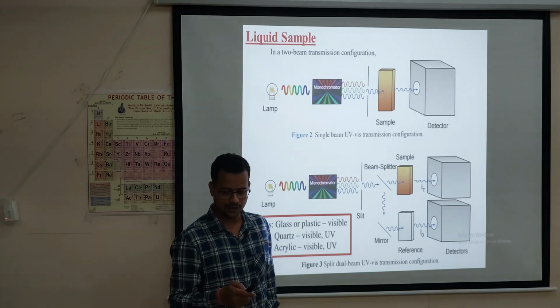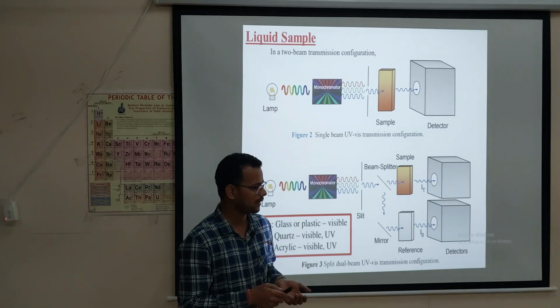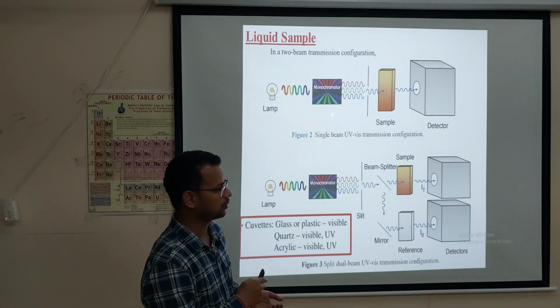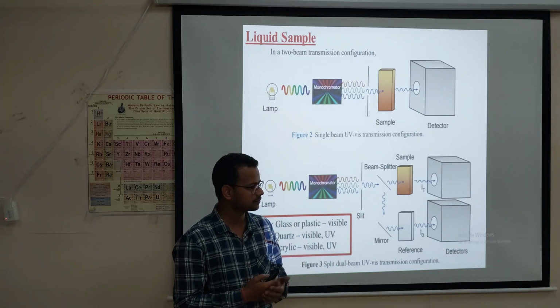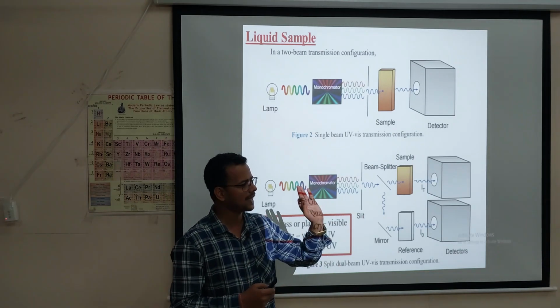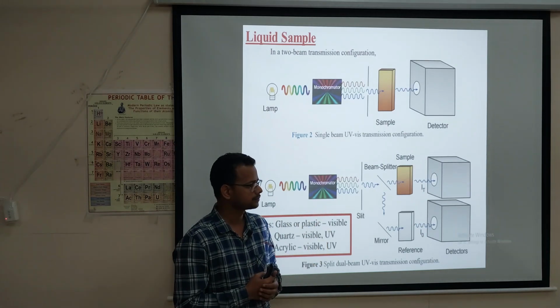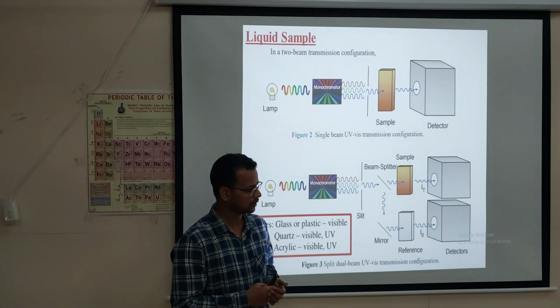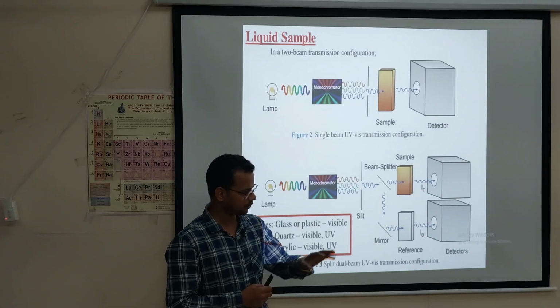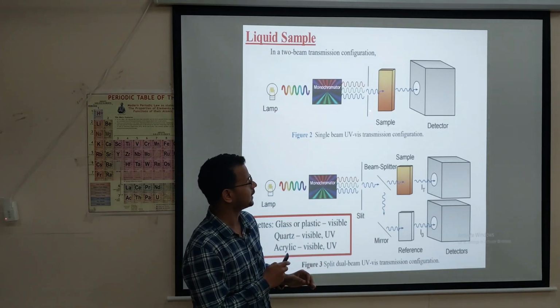If actually the monochromator separates light into various colors and the slit is not able to choose which color will pass, a slit does only one thing: it narrows the beam. Polychromatic, monochromatic, actually it will allow a monochromatic light source.